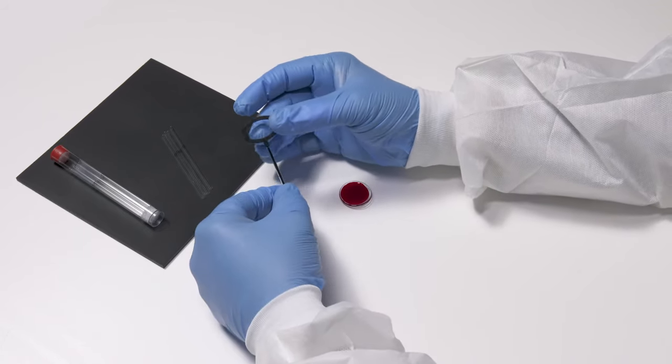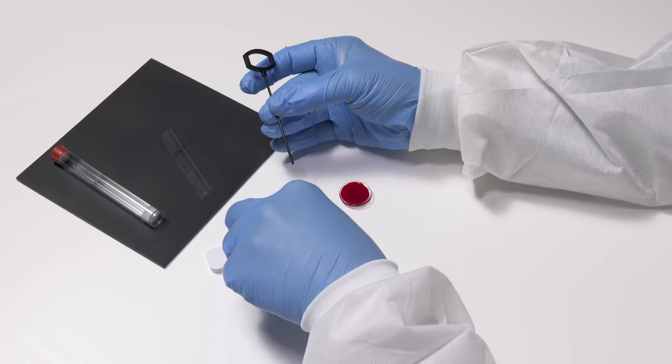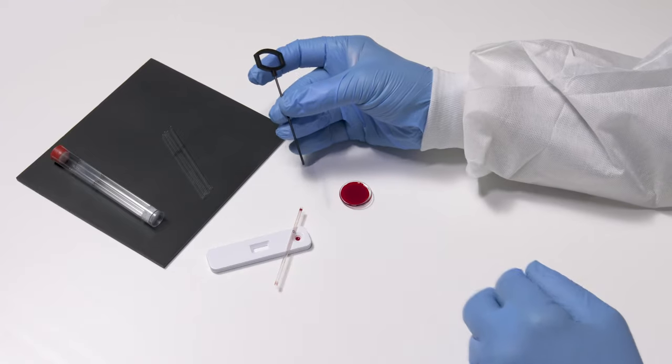WireTroll 3 sizes range from 20 to 200 microliters and can include Drummond's one-of-a-kind protective mylar wrap upon request.